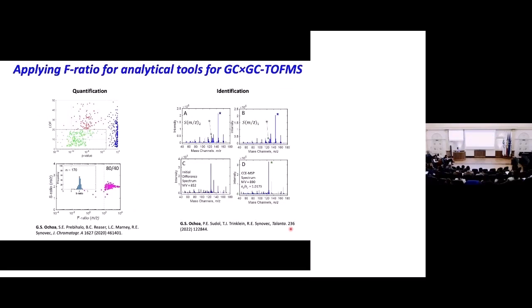So you can imagine after generating your hit list, we take the whole information we find and use it to find match channels that are statistically likely to be pure, so that we can enhance more thorough quantification, and by the same metrics we can use those to find match channels that make it easy to subtract spectra from each other after a normalization to get very good identification.